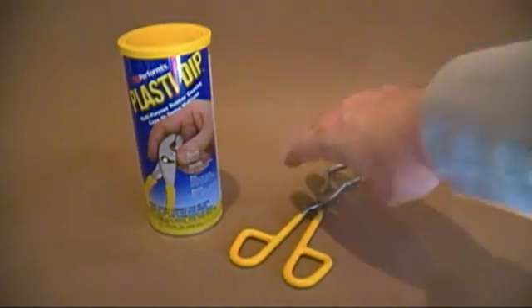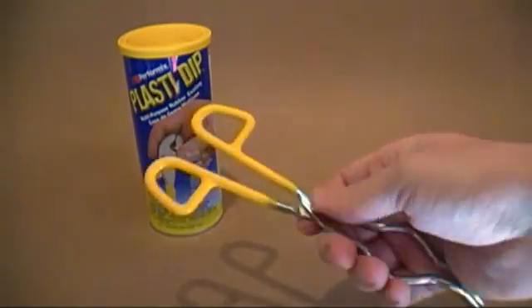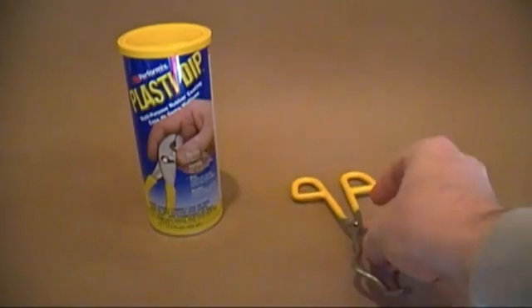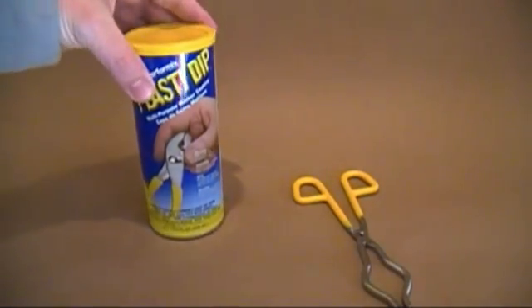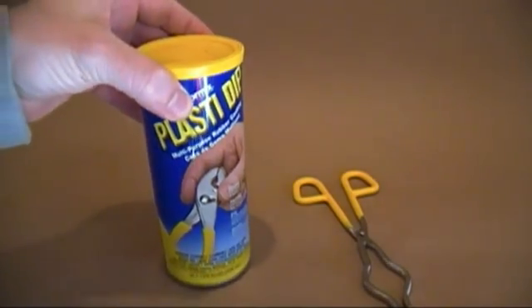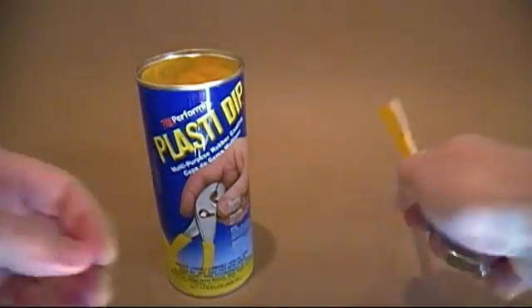The first tip is plastic dip. I use it to coat all my metal tongs and other metal parts I use in the lab. Chemistry tools are expensive, so doing what you can to protect them can extend their life and save you money. You can find this plastic dip in the paint section at Lowe's or Home Depot.